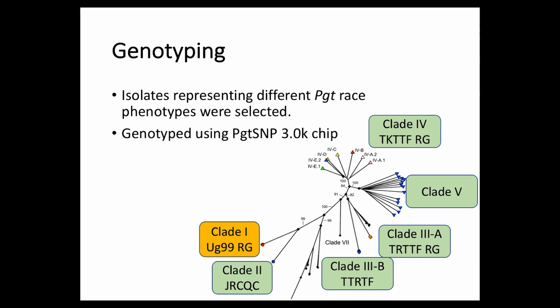So our task was to develop a diagnostic assay that would be able to distinguish between these different characters, and also a diagnostic assay that is quick and rapid in the lab, but is also a technology that's transportable so that it can be used in other regional laboratories. Those were the objectives when we were going forward to developing the assay.